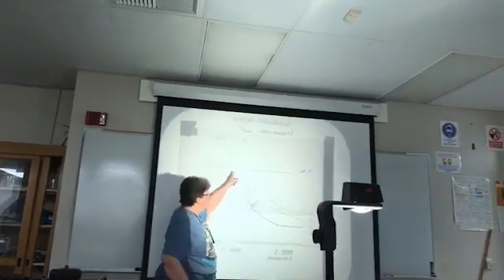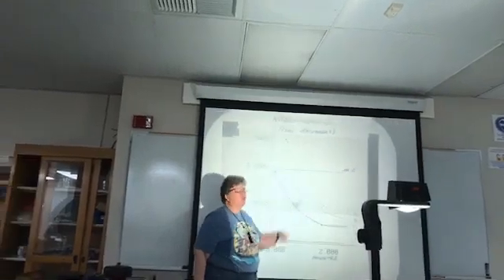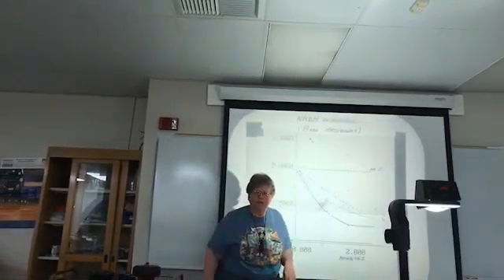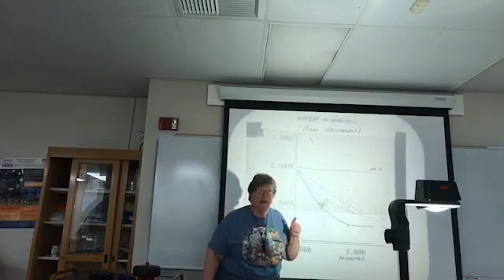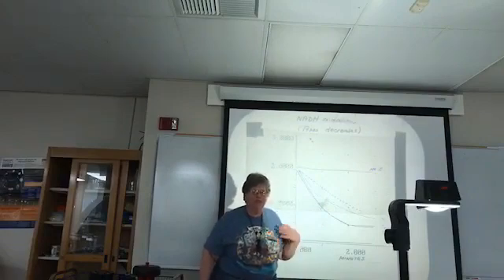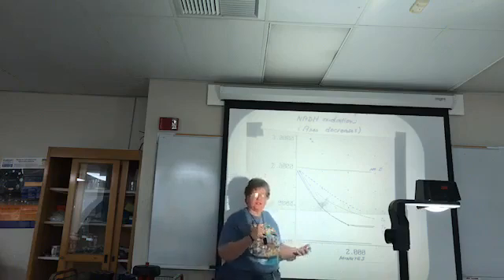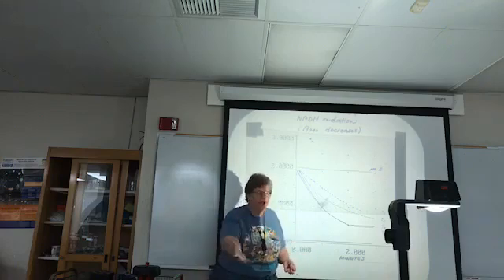So the reason it's going down is you're measuring your substrates. The last graph I was showing you was measuring some product, but we don't have the ability in this assay to measure product directly. Instead, we're measuring loss of the substrate, and our substrate, remember, is NADH.